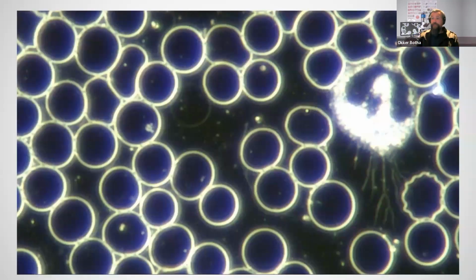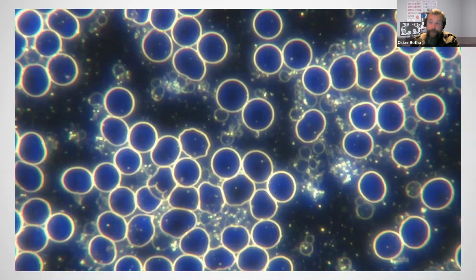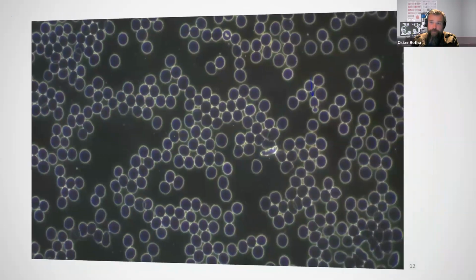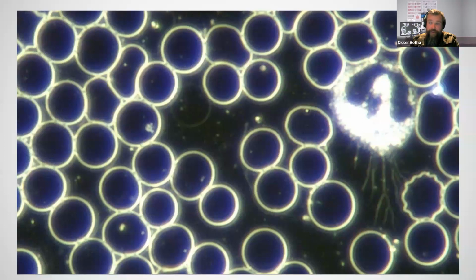All right, so these last few images, Elizabeth, these are just some that I've added on here just to show the level of magnification that we're able to get with the 100 times objective. So if I skip back to the previous slide, this is with the 40 times objective. So this is about 1,600 times magnification. Let me skip past this one. And that's then with the 100 times objective. So this is about a 4,000 times magnification.